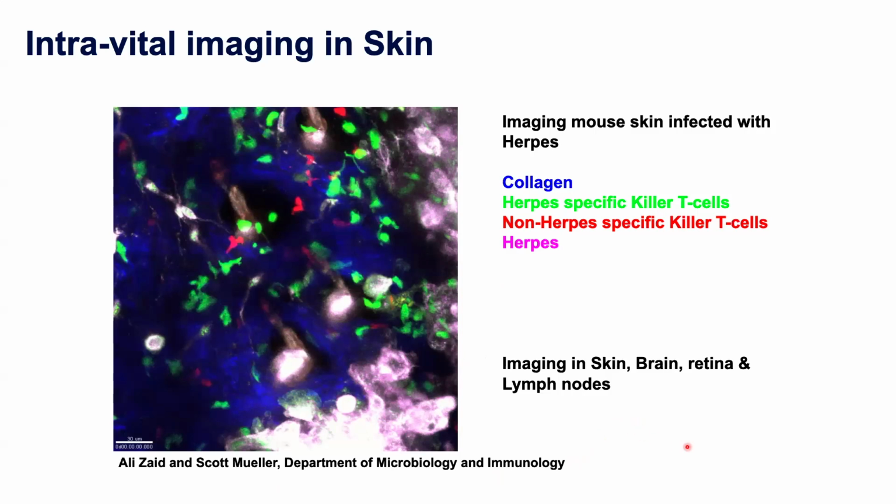So very good for imaging, a few hundred microns up to potentially a millimeter into live samples, if that's what you're interested in.